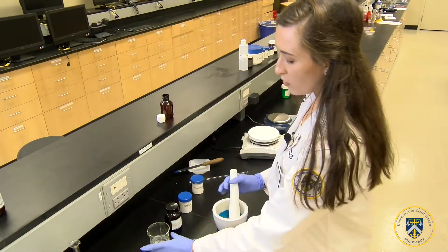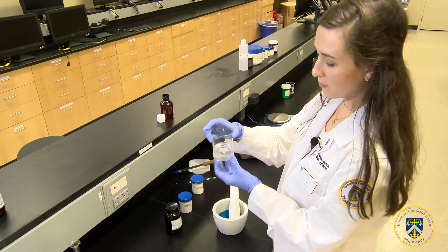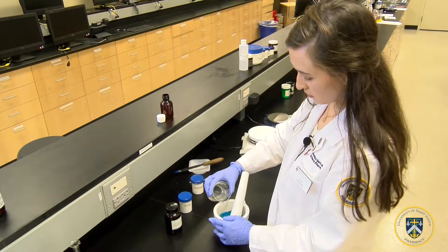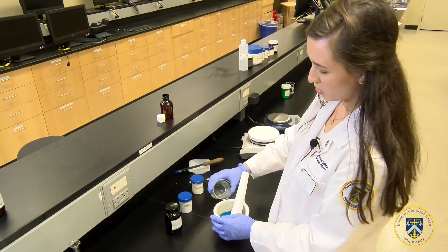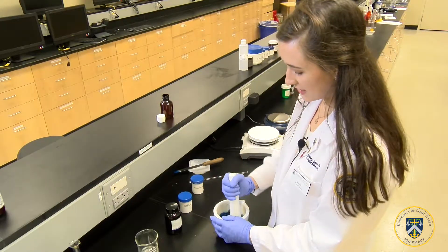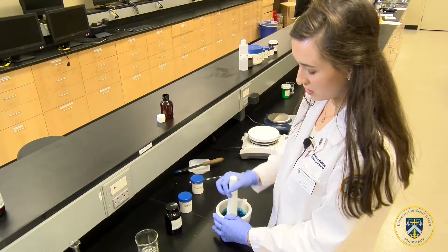Then we will be adding 40 mls of our methyl cellulose gel to the mortar. Looking down to make sure we add exactly 40 mls, and now we use that same circular motion to triturate this solution.